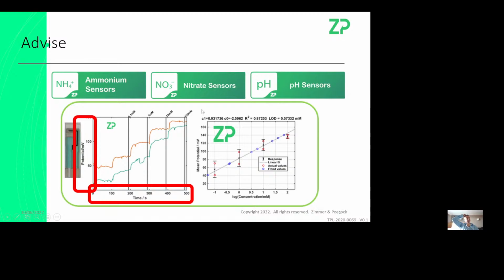My advice is if somebody's trying to make a potentiostat for measuring ion selective electrodes, maybe start with pH, because pH is something that you can readily test. You can always get acids and bases, let's say, and so you can readily test this kind of application.